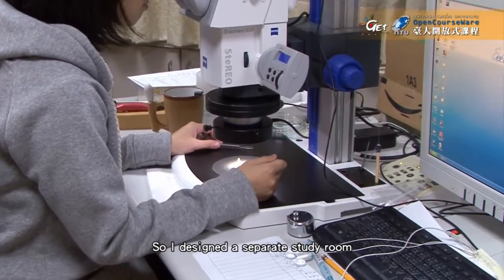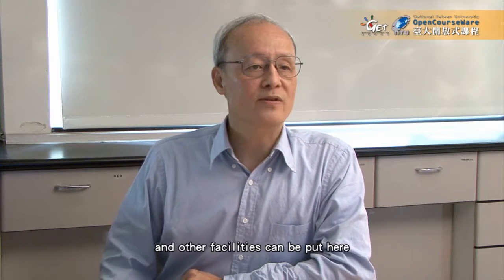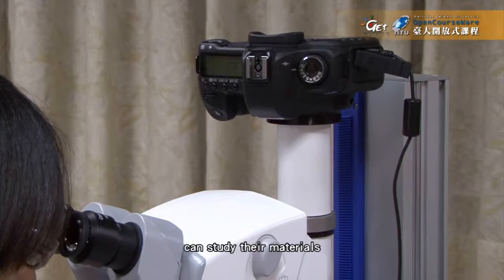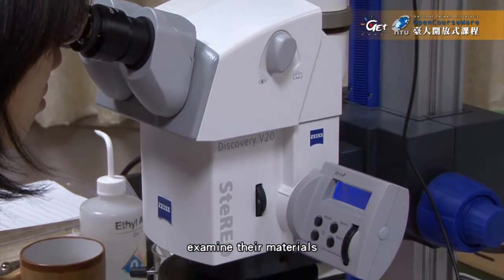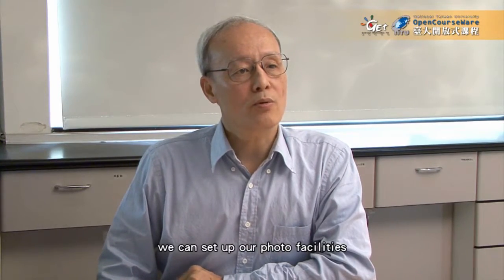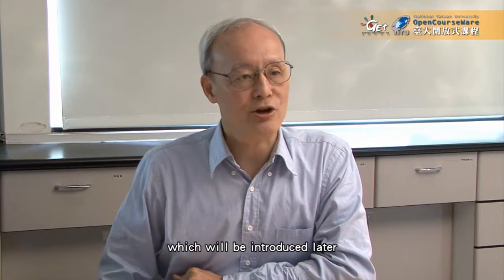So I designed a separate study room so that a microscope and other facilities can be put here, and the taxonomists or scientists can study and examine their materials without interfering with the collection. Also, in this room, we can set up our photo facilities for our digital archive program, which will be introduced later.